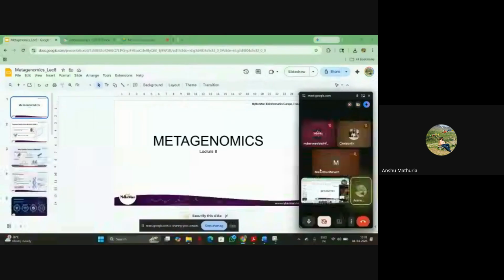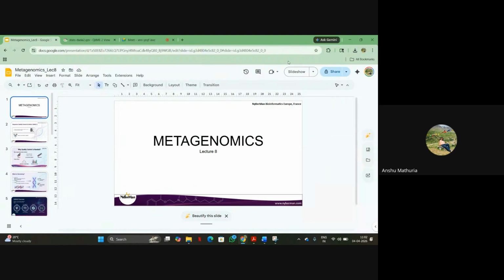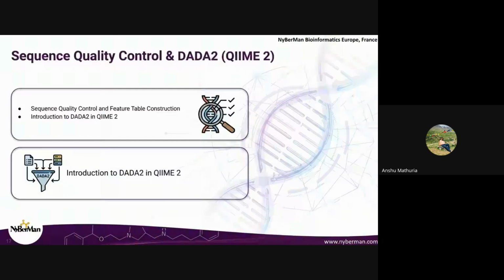After demultiplexing, the next step is denoising. So I'll share my screen and let me know if it is visible. Is it visible? Yes, ma'am. Okay. So today's topic will be about sequence quality control and denoising.